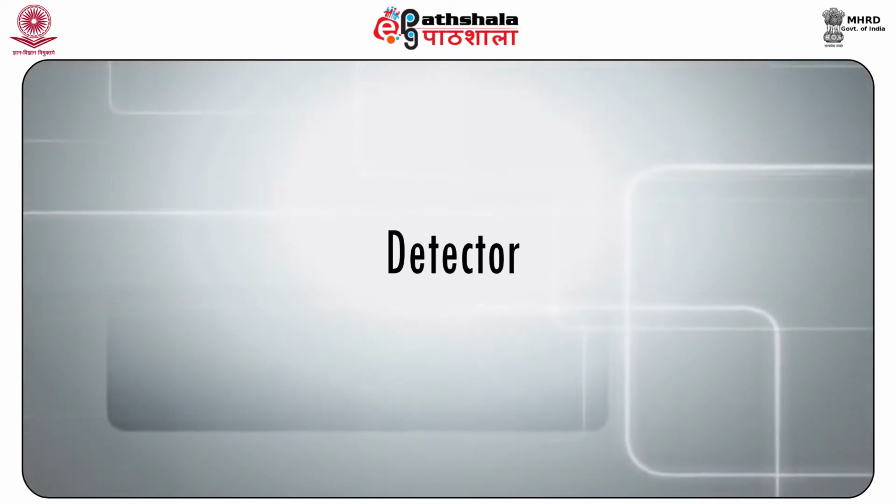Number 4 is the detector. In this instrument, flame photometric detectors are used. The radiation emitted by atoms is in the visible region, that is, from 400 nanometers to 700 nanometers. The flame photometric detector, FPD, is known for its hydrogen-rich flame, because it is much cooler than the oxygen-rich flame, which is used in the flame ionization detector, FID.